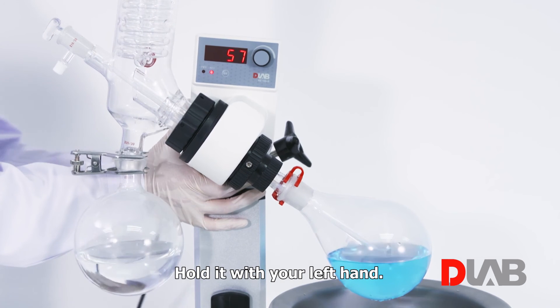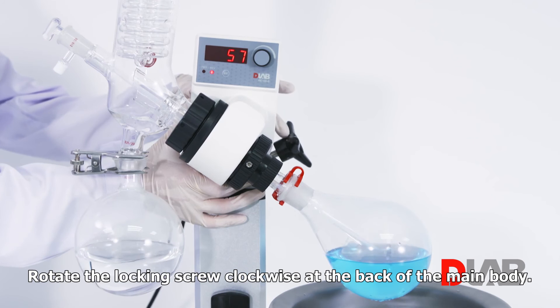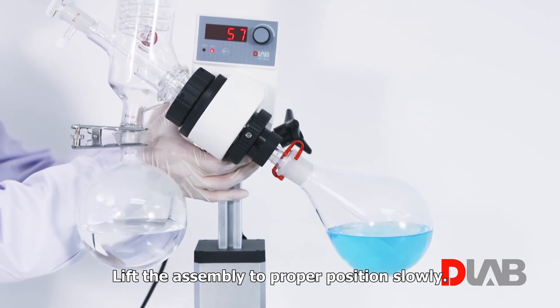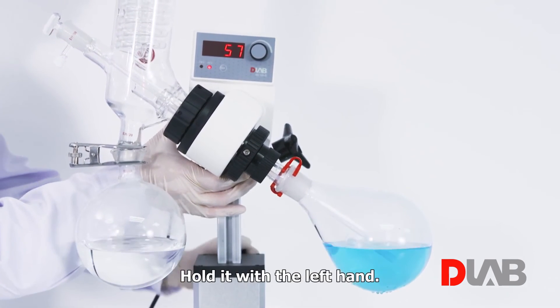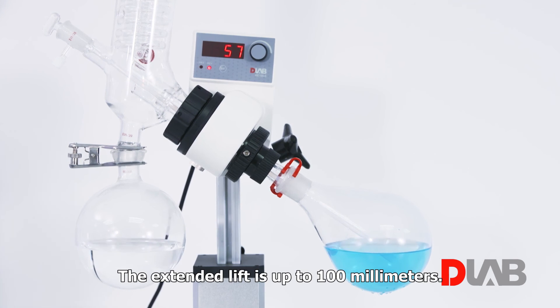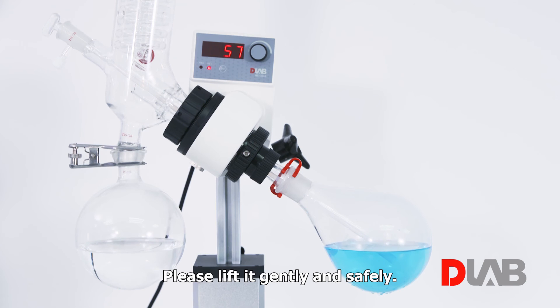For the extended lift, hold the main body with your left hand. Rotate the locking screw clockwise at the back of the main body, then use both hands to lift the assembly to the proper position slowly. Hold it with the left hand and rotate counter-clockwise to lock the position with your right hand. The extended lift is up to 100 mm. You can lower the assembly the same way. Please lift it gently and safely.